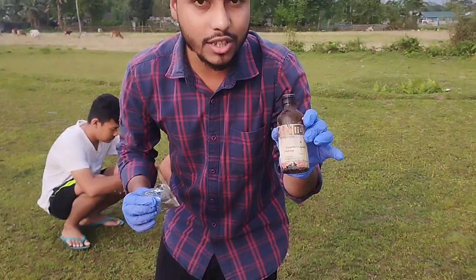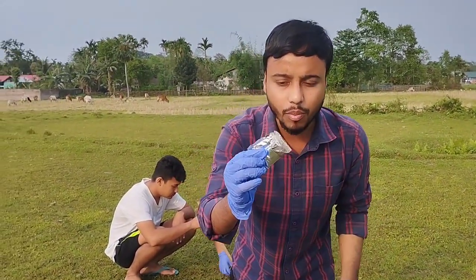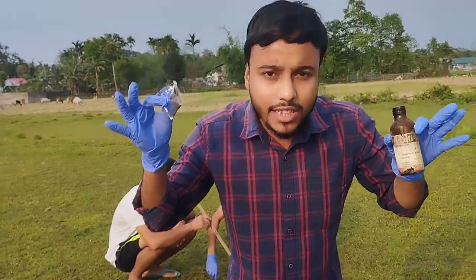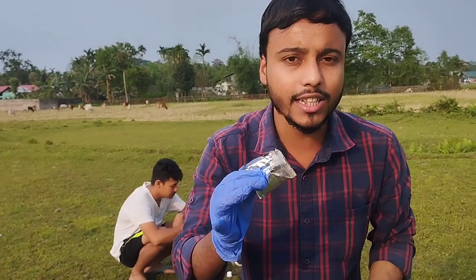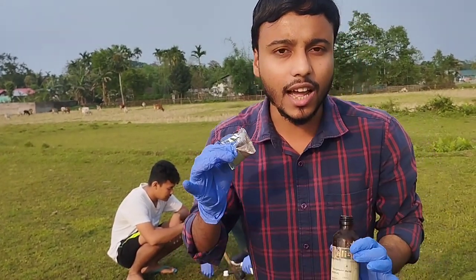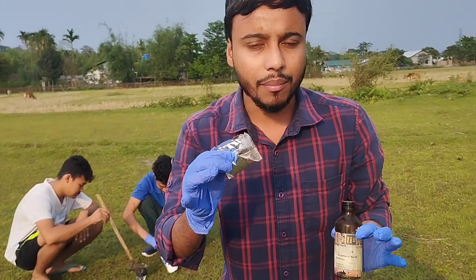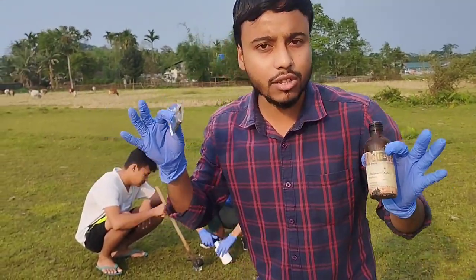First, sulfuric acid — estriacophore. Next, potassium permanganate. How can we use this chemical acid? How can we use potassium permanganate? How can we use this experiment? How can we just put our scientific reasoning?